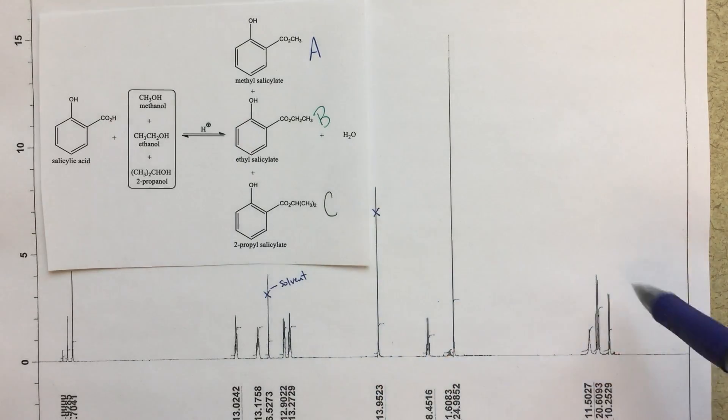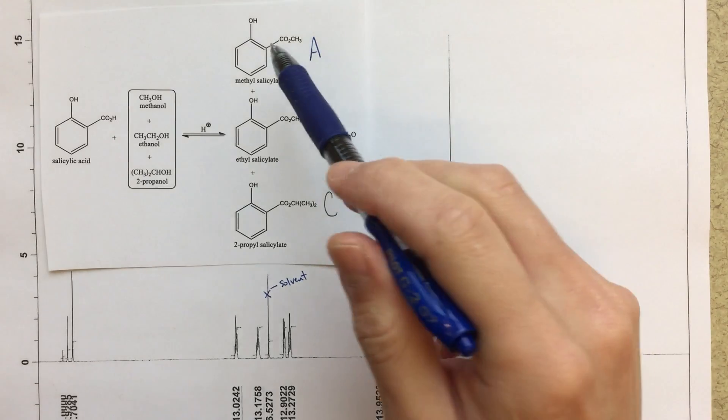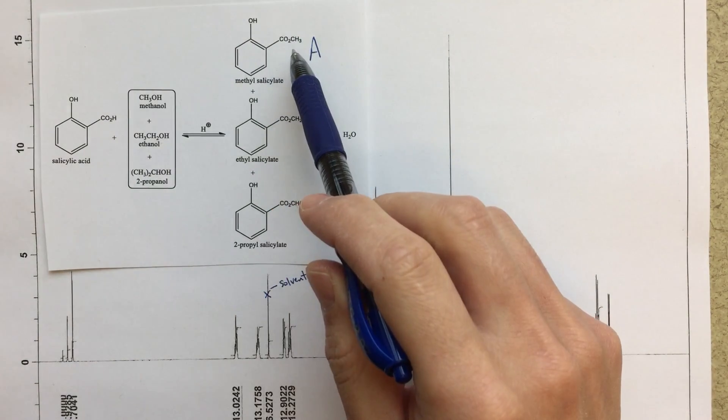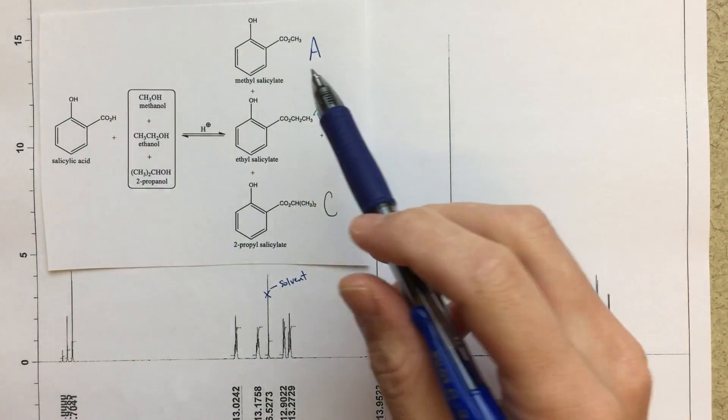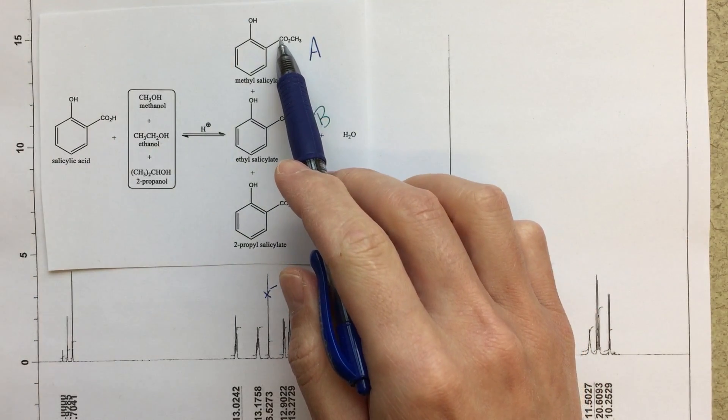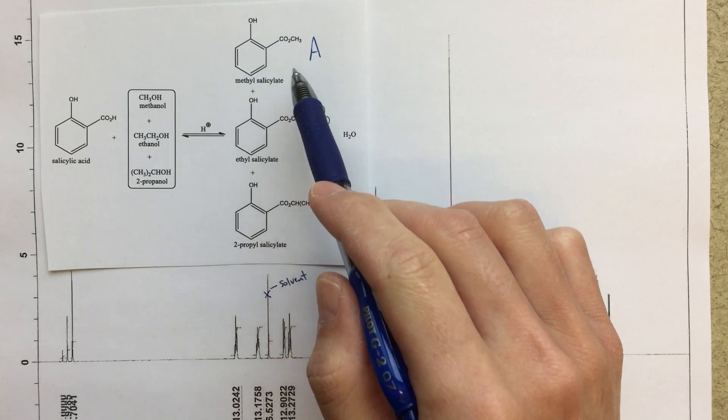But first we would need to figure out which one is A, B, and C. Now looking at this other region, I can start picking things out. And the first thing that I might look at is, well, in A I should have a methyl group. I should have a three-high group that is a singlet. So this CH3 bonded to C, so this is an ester, C double bond O bonded to O, and then this methyl group.